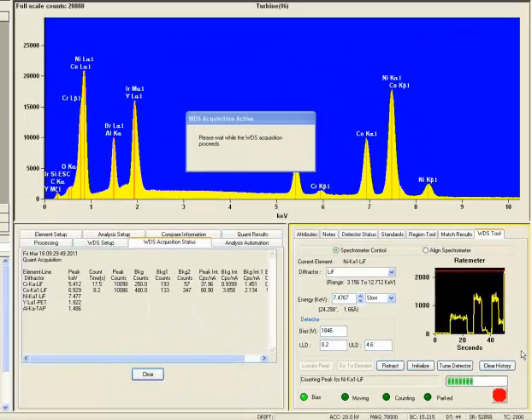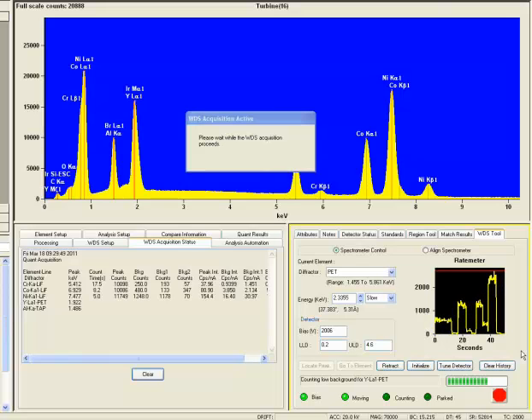It's on to analyzing the nickel. Completed the nickel and moving on to the yttrium. You can see the yttrium peak is significantly lower than the other peaks, but it is higher than the original data point that we had collected at the original stage position. So it collected that low background for a very short amount of time. The peak was a very short time. Can move on to the aluminum.